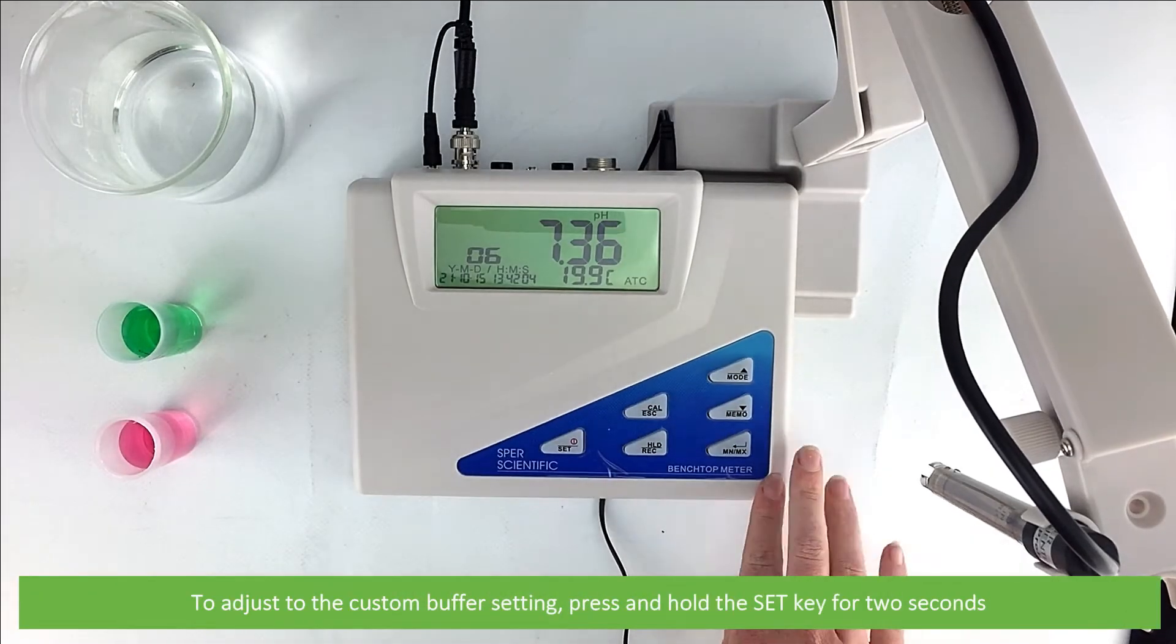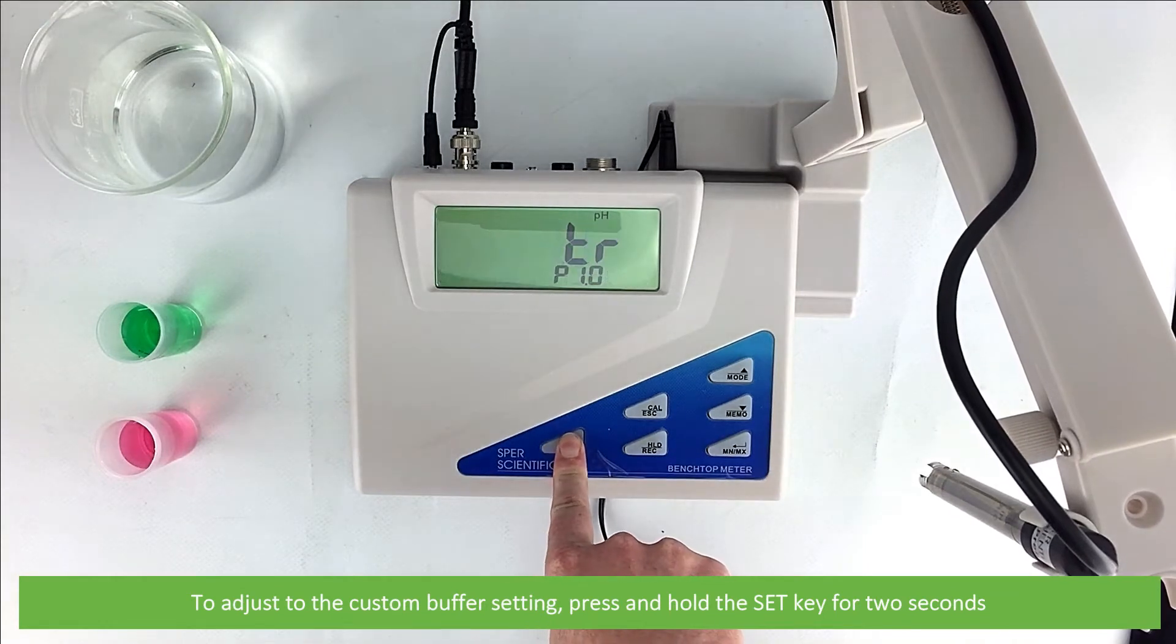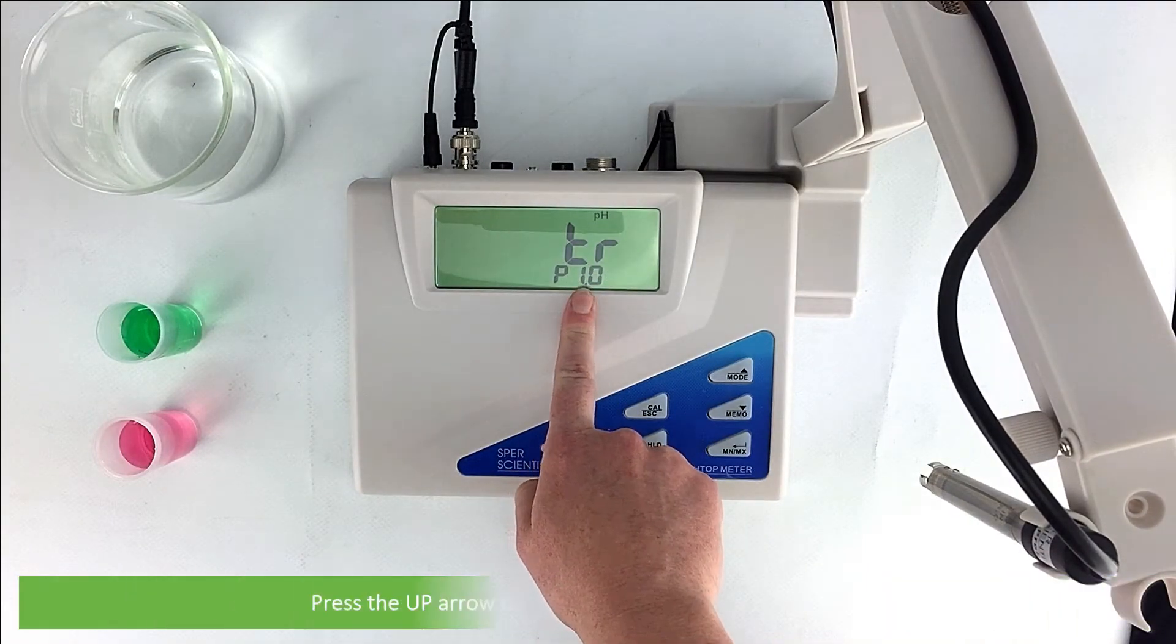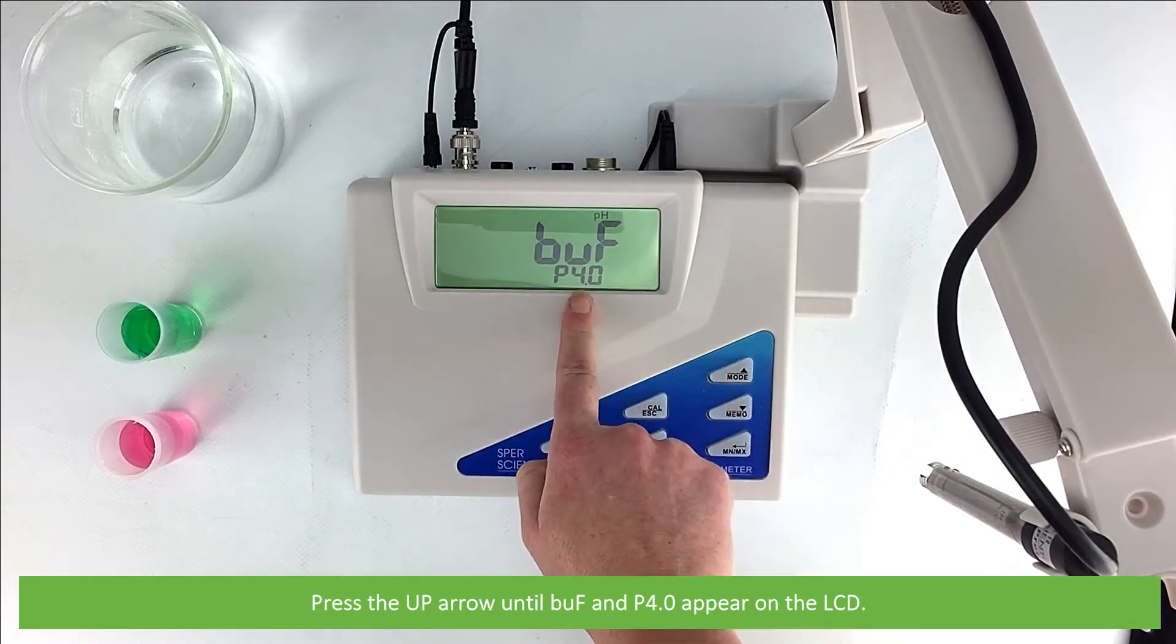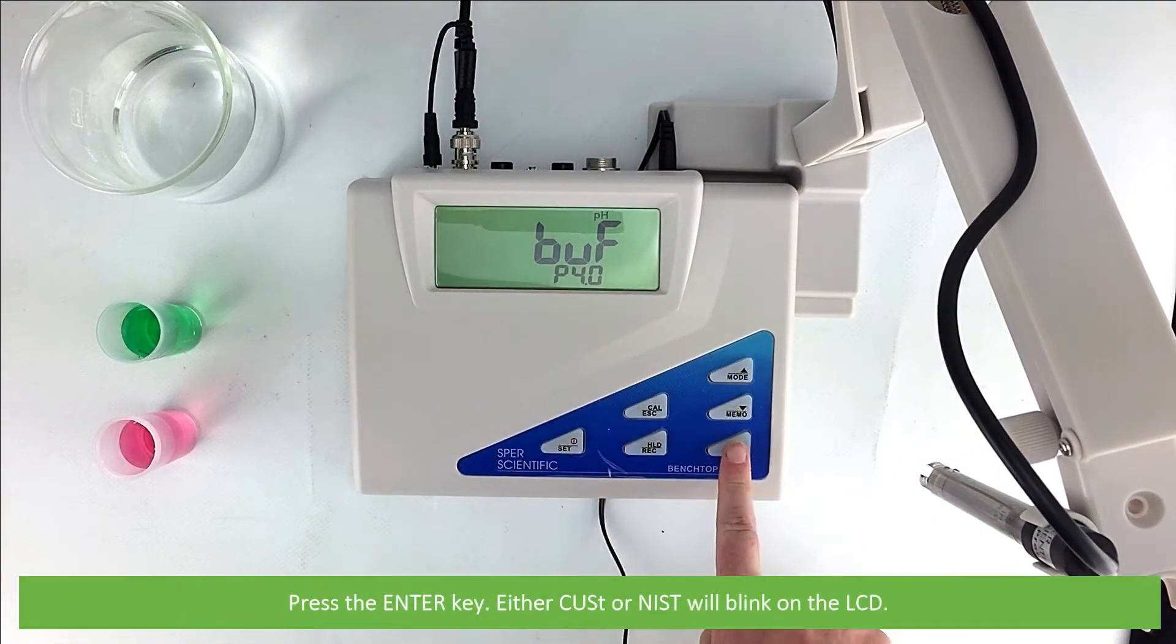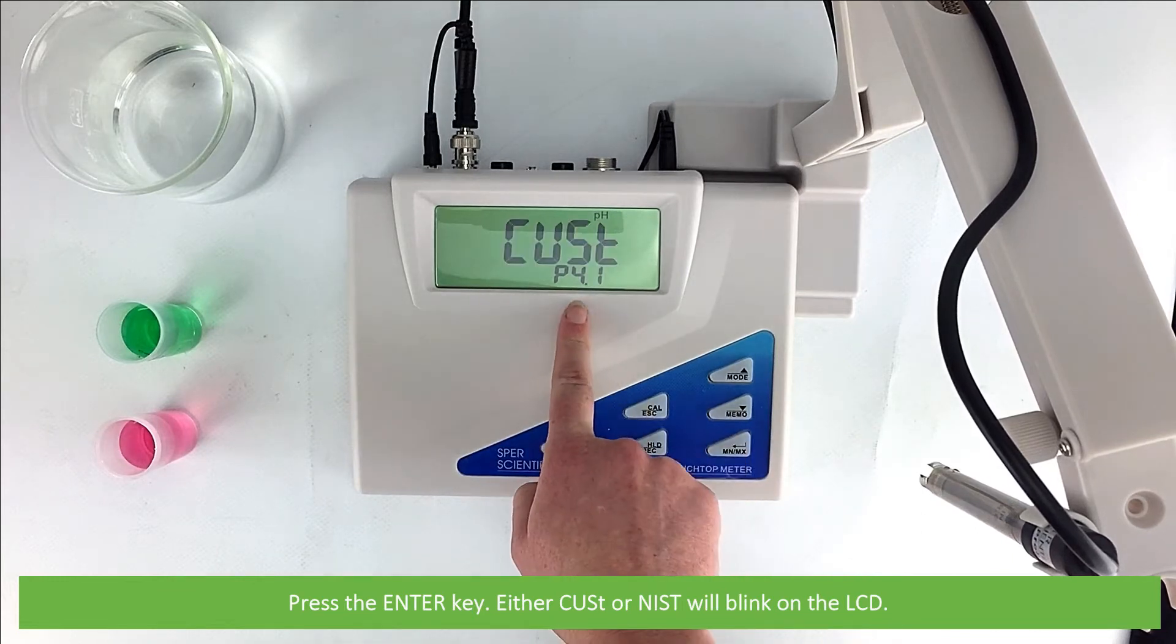To adjust to the custom buffer setting, press and hold the set key for two seconds. Press the up arrow until BUF and P 4.0 appear on the LCD. Press the enter key. Either CUST or NIST will blink on the LCD.